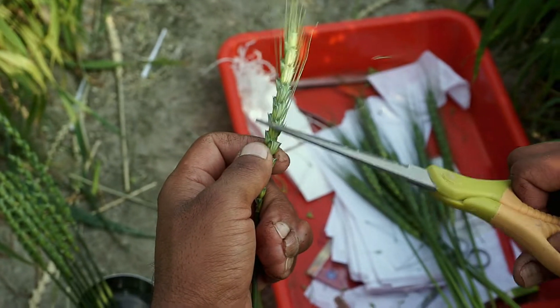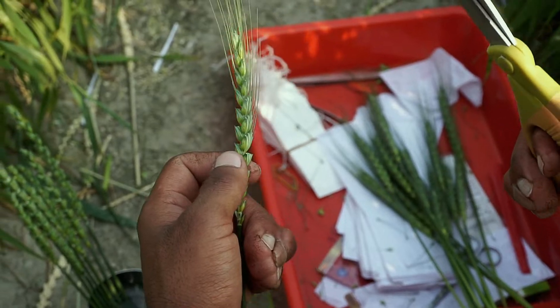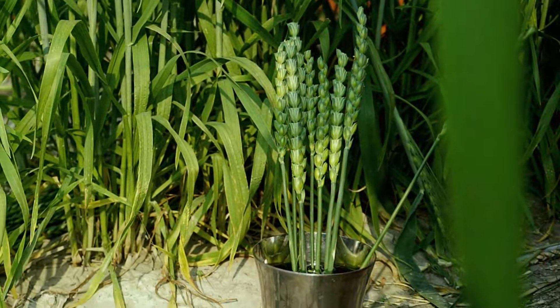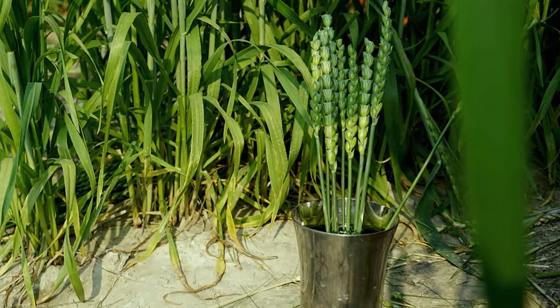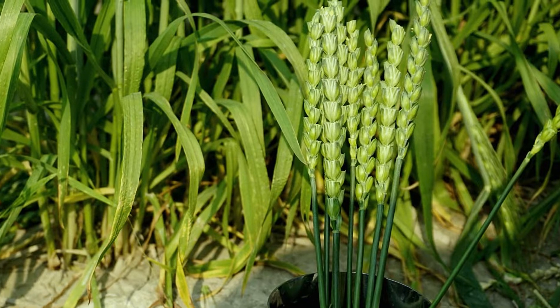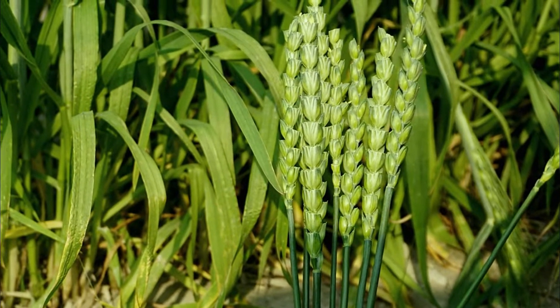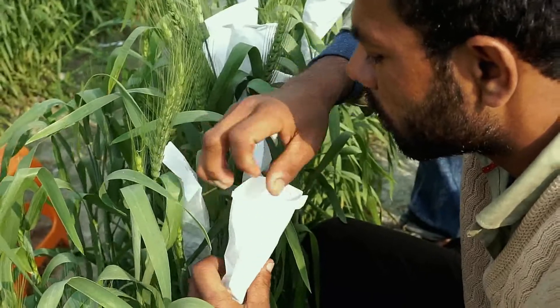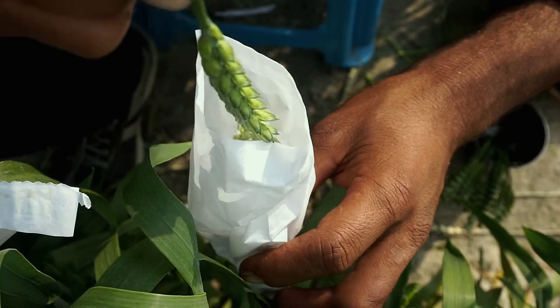Cut the spike with peduncle; the spikelets shall be cut down from the edges. Leave the spike dipped in a tumbler filled with water, facing towards the sun. After four to five minutes, the anthers will start coming out of the florets. Cut the butter paper bag from the top and carefully dust the pollen on the emasculated spike.